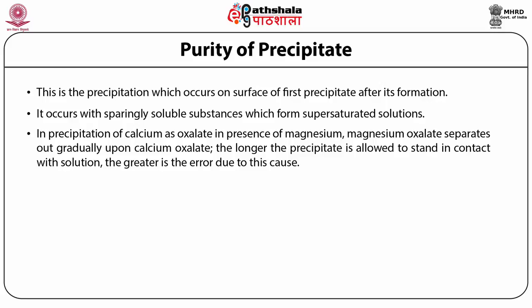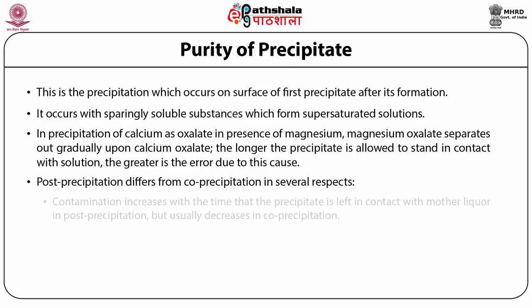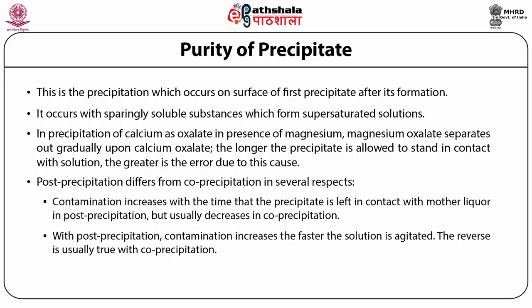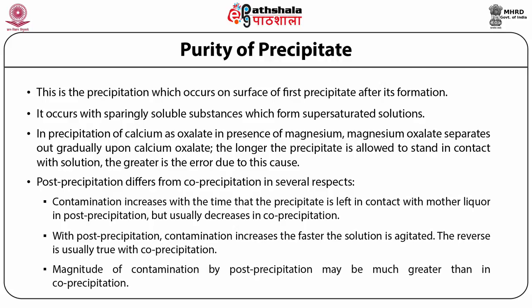Post-precipitation differs from co-precipitation in several aspects. In post-precipitation, contamination increases with time the precipitate is left in contact with the mother liquor, but usually decreases in co-precipitation. With post-precipitation, contamination increases faster when the solution is agitated, whereas the reverse is usually true with co-precipitation. The magnitude of contamination by post-precipitation may be much greater than in co-precipitation.